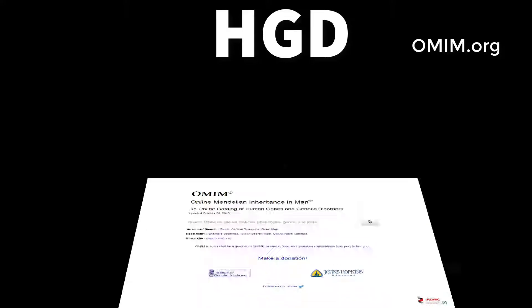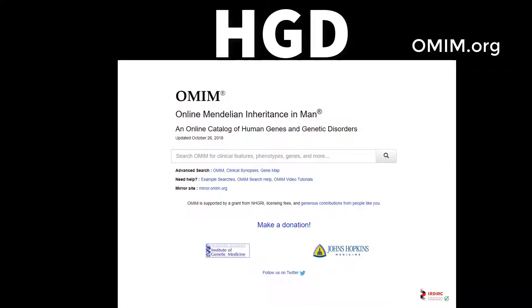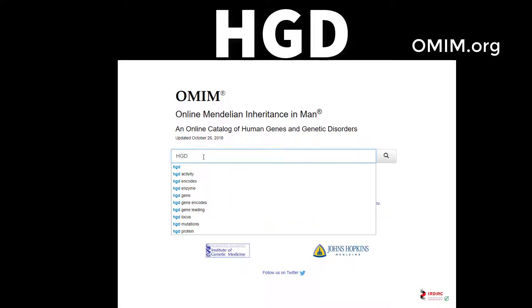Starting out by giving a shout out to the Online Mendelian Inheritance in Man website, also known as OMIM, which is just a great genetic reference. If you haven't used it yet, give it a shot. We're going to type HGD because we already know the gene we're looking for. This website will give us all the information we could want about HGD — it won't give us the actual reference sequence, but there will be links and ways to get to the reference sequence from this website.